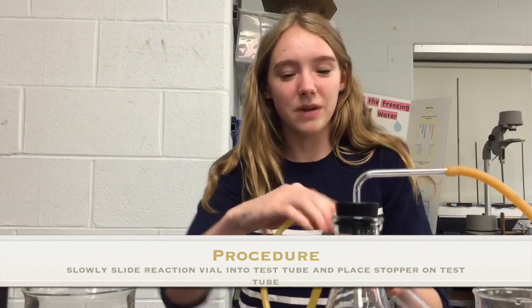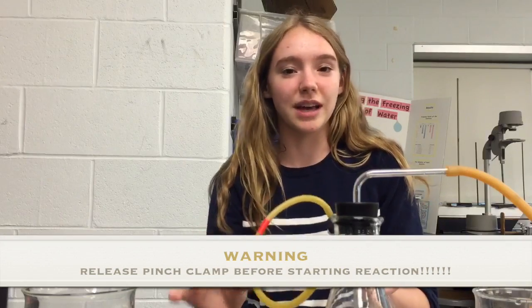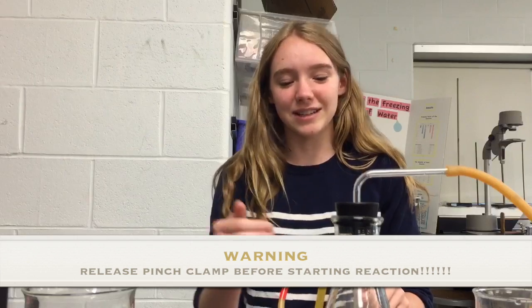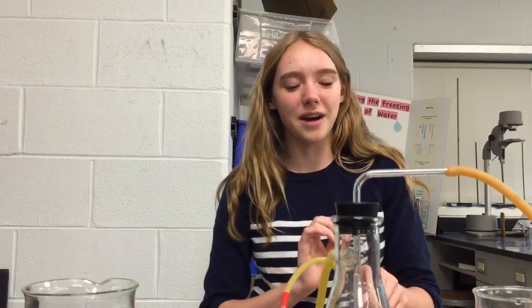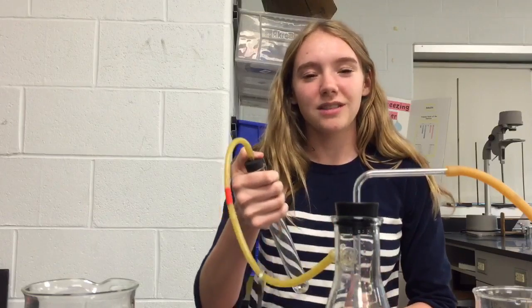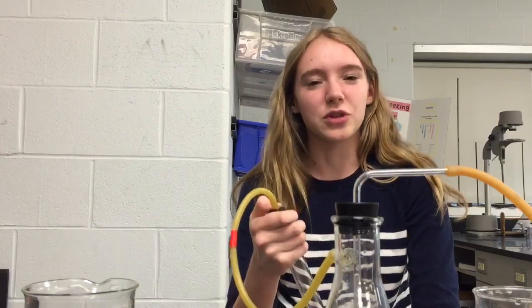Close the stopper in the test tube and make sure to unclip your pinch clamp. Previously it was used to prevent liquid from going into the test tube, but now gas needs to flow out. Then place your thumb over the stopper and shake vigorously — make sure not to turn it upside down, because liquid will get through the tubing.